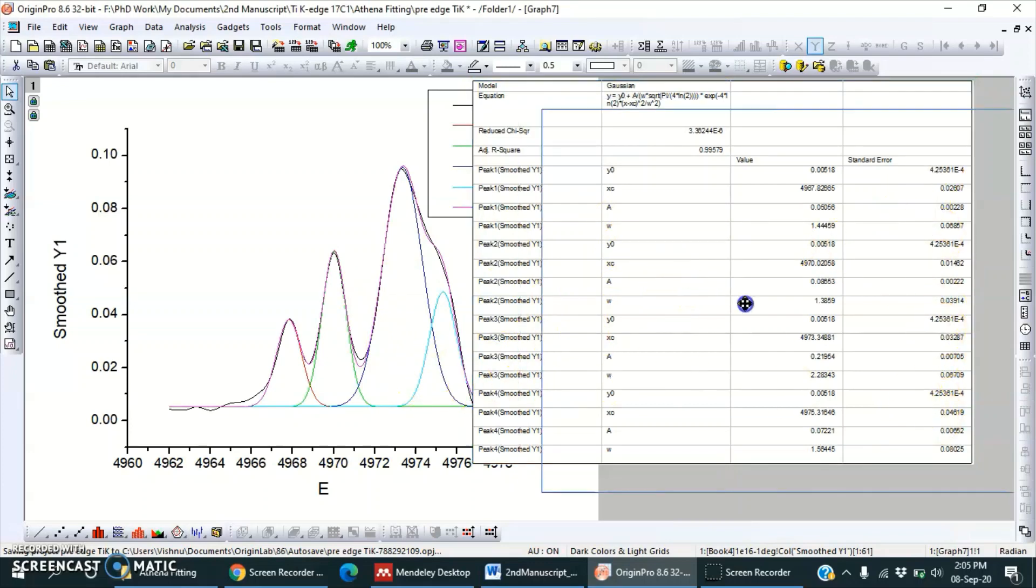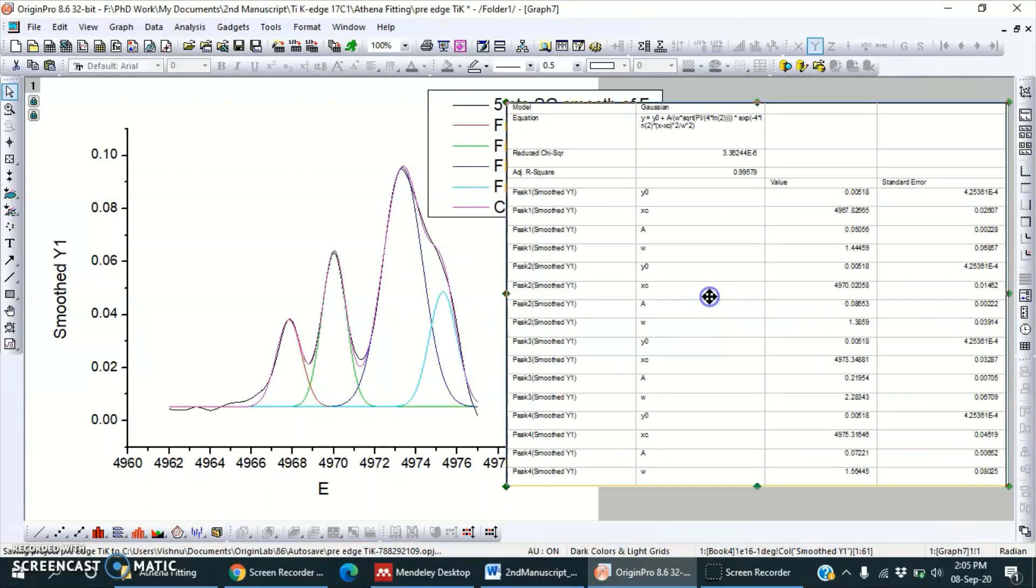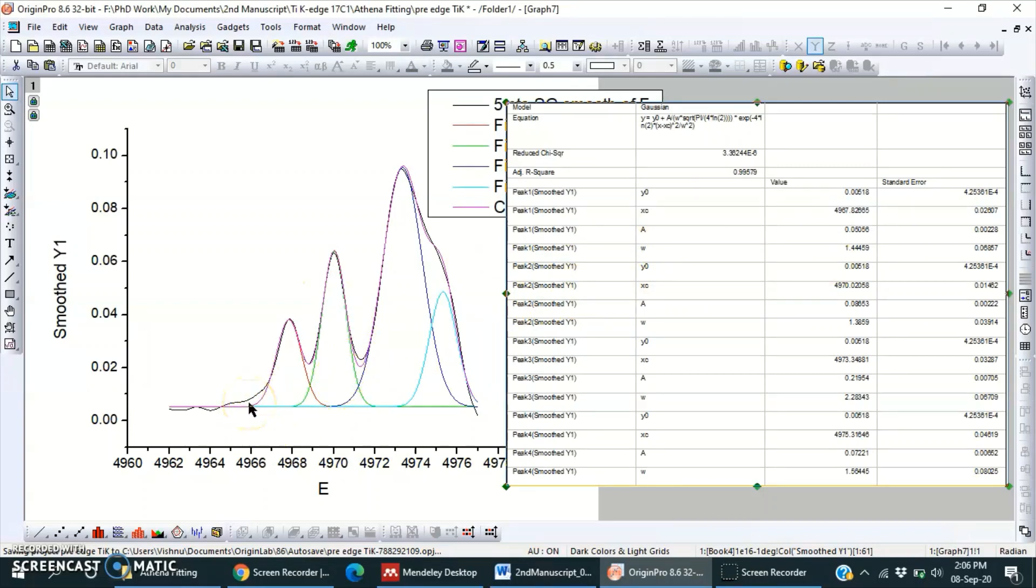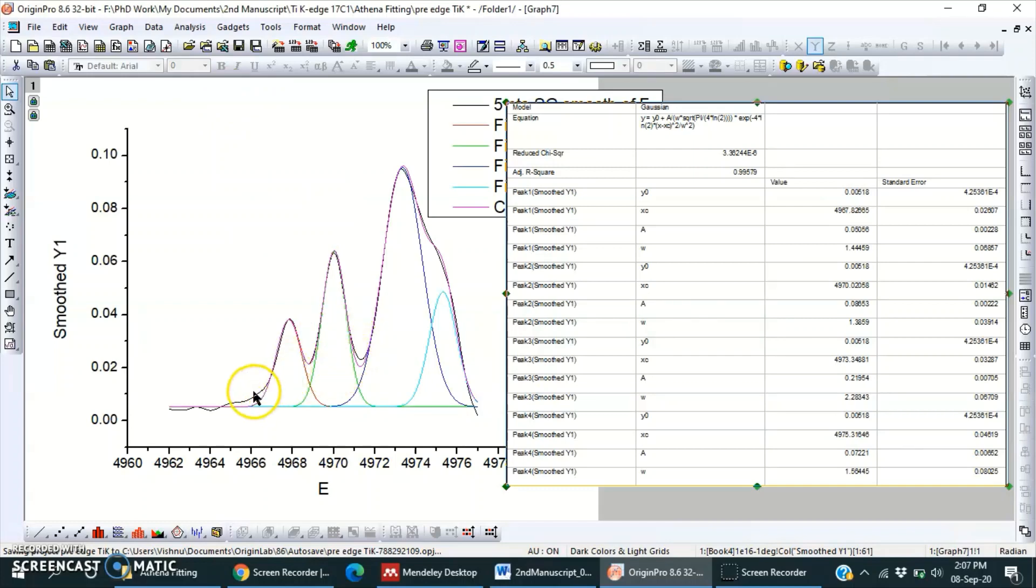We can use these parameters for comparison. And somehow I don't like this region, it is not a good fitting here. So we can choose Lorentzian functions also. As in peak fitting we have a lot of functions to choose, so Lorentzian will be good for this peak.